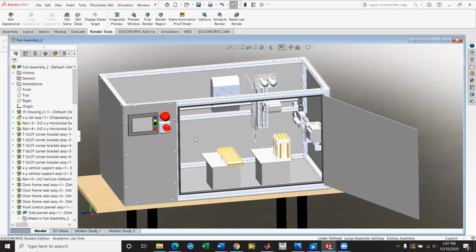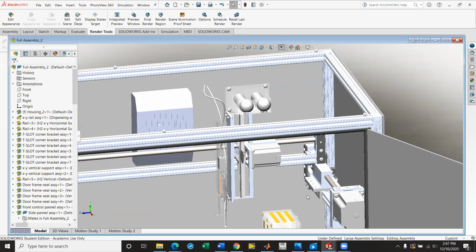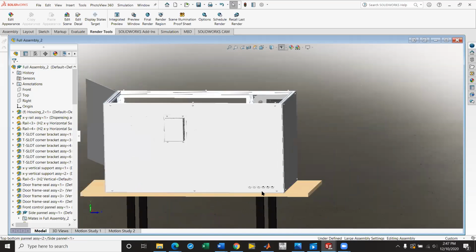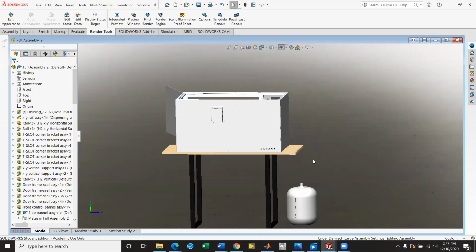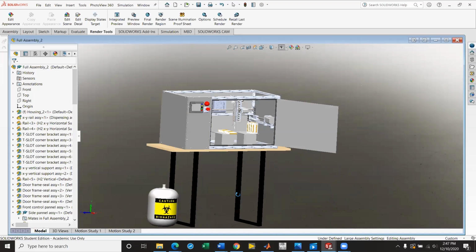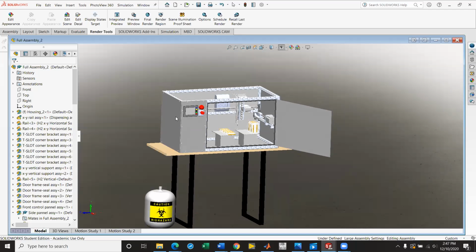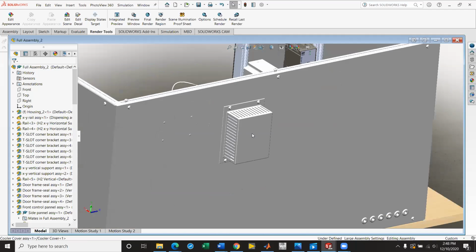We've got our controller interface, emergency light indicator, and emergency stop button. Peristaltic pumps for the fluid dispensing system are mounted to the back wall. And then around the back, we have the ports for the different gases to be brought into the system and also to be disposed of. This is just an example of the fluid gases being collected in a chamber. We also have our ambient cooler. We added a cover to it as per request from Design Review 2.